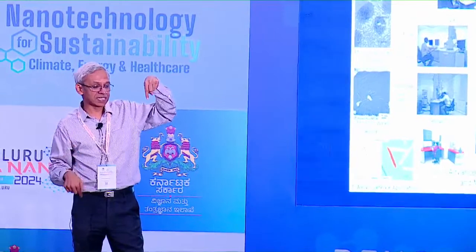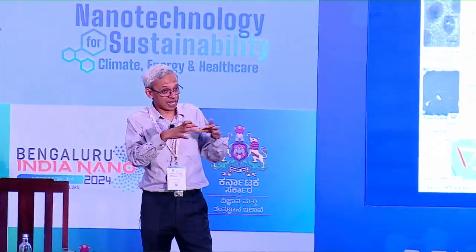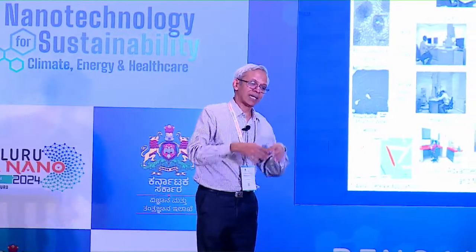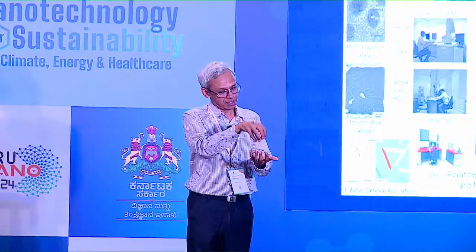But remember, all those things require the crystalline specimen to be oriented properly. We have to see individual atomic columns, right? Therefore, for an amorphous specimen, it's not possible to do that. But at a lower resolution, if you want to see that this region has a higher average atomic number, such as the particles, then those things can be done at a much lower resolution.